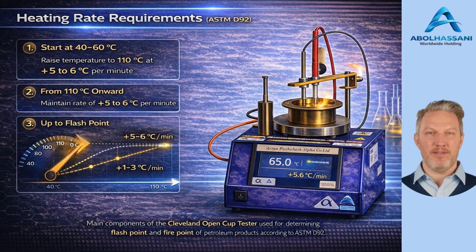Heating rate requirements. According to ASTM D92 Section 11, Procedure, the sample must be heated at a controlled rate of 5 to 6 degrees Celsius per minute. Maintaining this heating rate is essential for consistent vapor formation above the sample. If the heating rate is too fast or too slow, the flash point may be inaccurate. Laboratories must carefully control the heating system to maintain this temperature increase throughout the test.